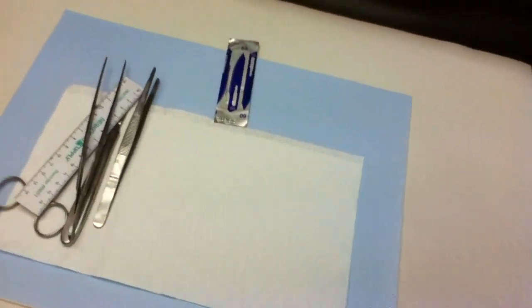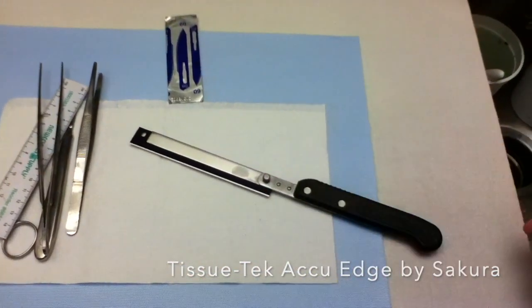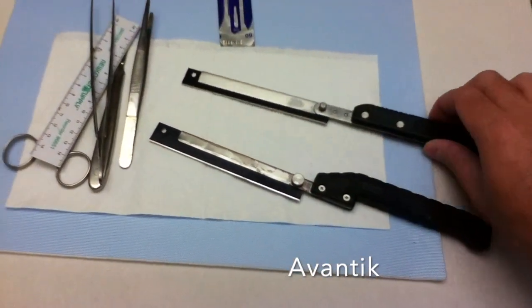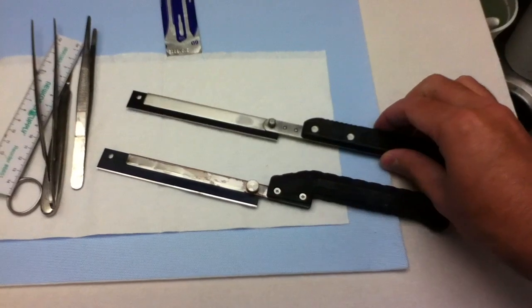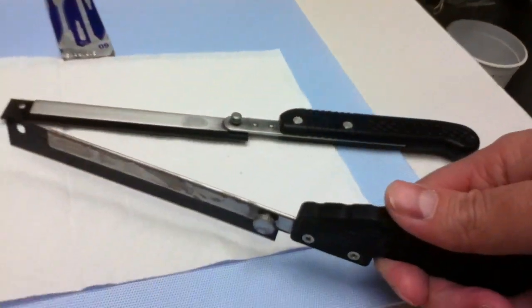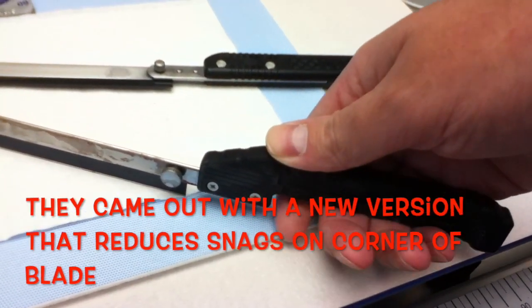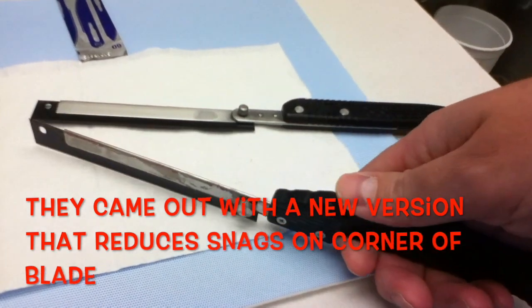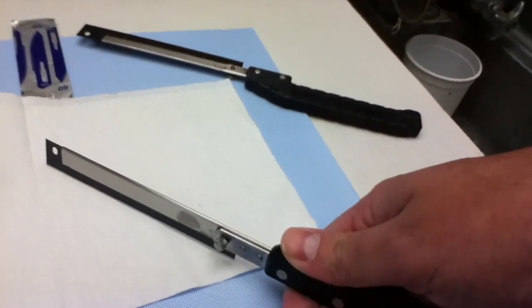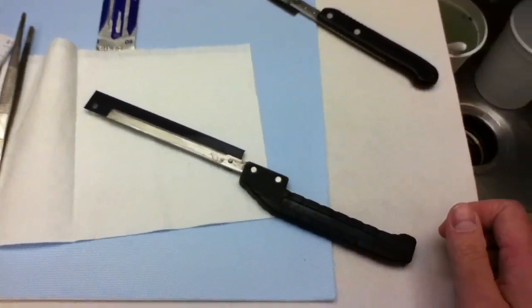I also use these blade holders. The standard one has a shorter-sized blade. This one is made by Advantech and has an offset handle — your hand is raised slightly versus the original. This is useful when cutting because the blade can go completely down to the board and my hand isn't touching it, allowing a full cut. With a standard blade holder, I can't put it all the way down because my hand hits the board. These are really useful — I'm not paid by Advantech, just a genuine recommendation.